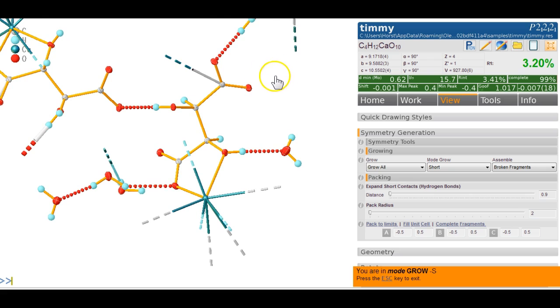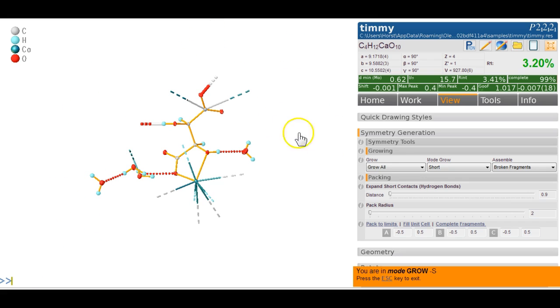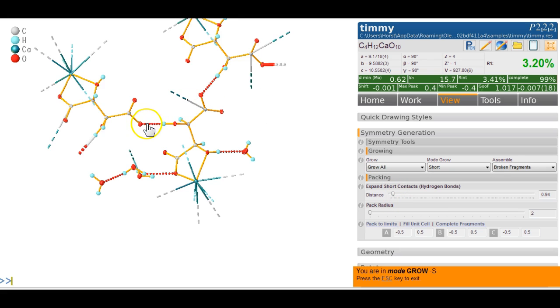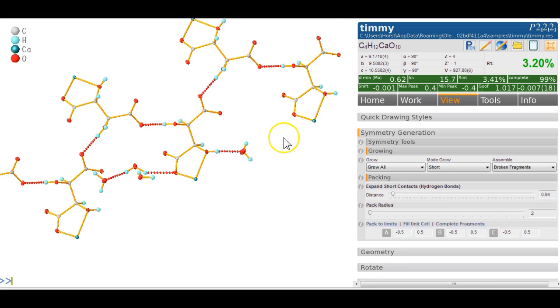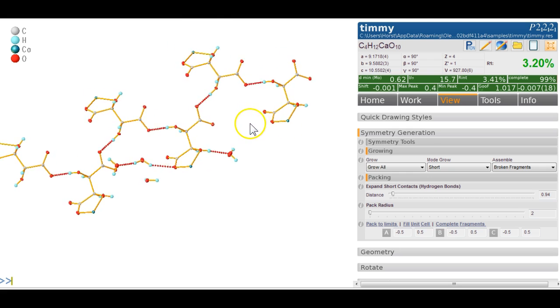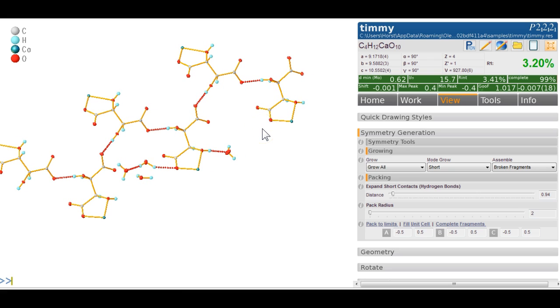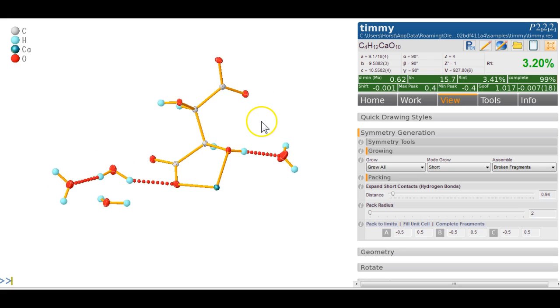This is building up the hydrogen bonding network based on the shortest distance found in this structure. I hope you can see the potential of this. I fused by mistake, so going back, I grow this again here and here, and the same one maintains and stays on. You can zoom out and see this is the shortest distance, which doesn't necessarily mean it's the strongest bond, but it's how you can start building up a hydrogen bonding network.